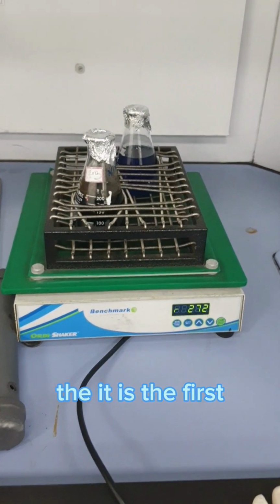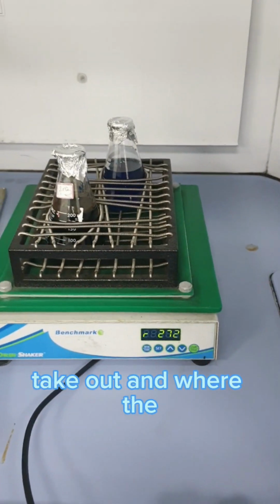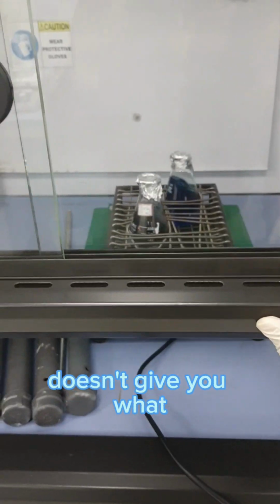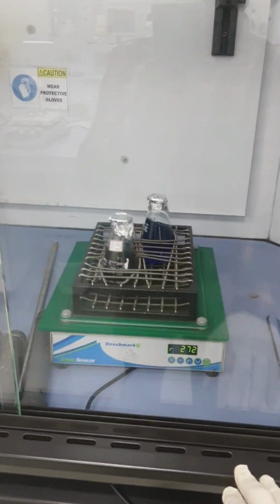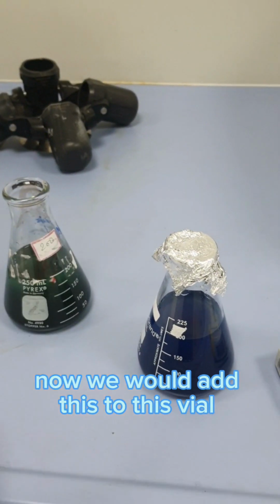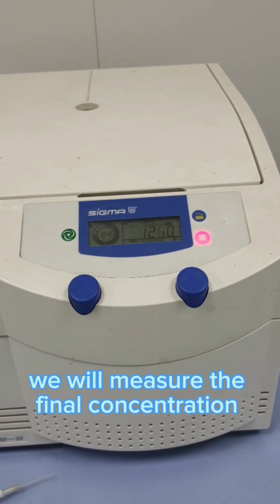It is the first adsorption cycle, or you can say the first regeneration cycle, and the second step we would pick out and measure the concentration. Then we would desorb it. So let's start the first step, closing the fume hood, and after 8 hours we'll measure the concentration. This is the first set of regeneration done. Now we would add this to this vial and centrifuge, and then we'll find the final concentration. Now centrifugation has begun. After 10 minutes we will measure the final concentration.